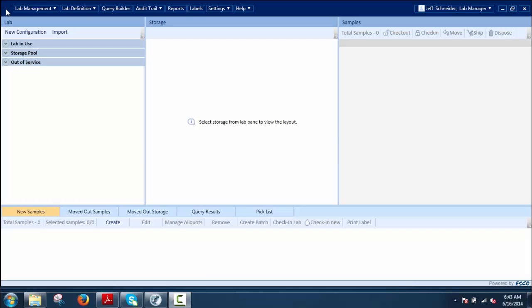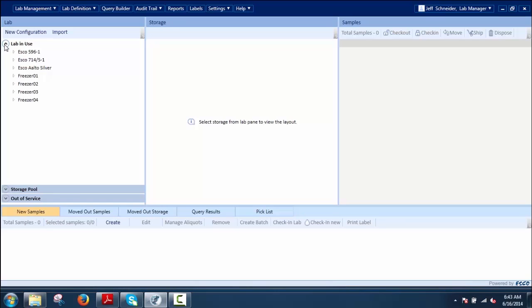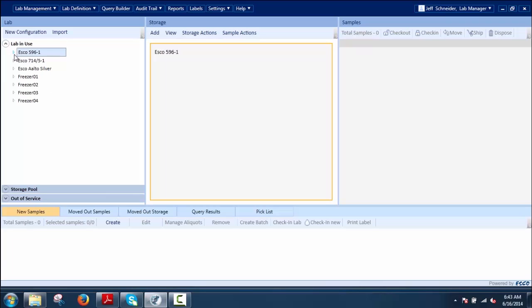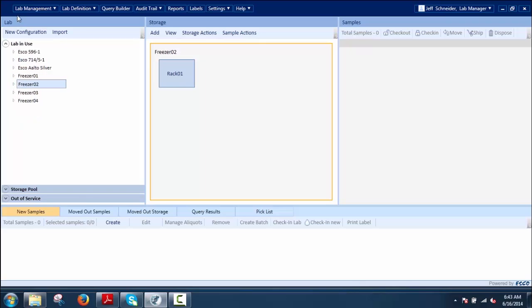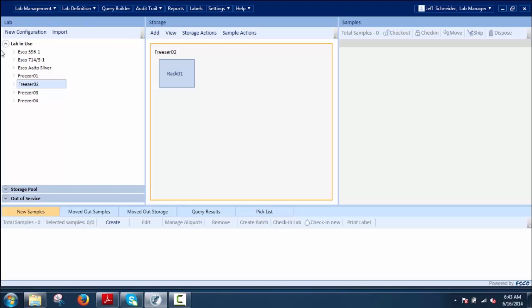Lab Management is used to create the lab by placing storages in defined relationships and to store samples within those storages. It organizes samples and storages so the user can access each sample and storage conveniently and perform required operations based on privileges assigned. There are two options in the Lab Management module: Storages and Samples, and Configuration Templates.